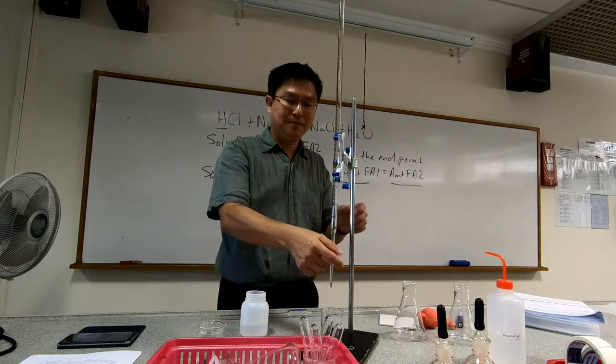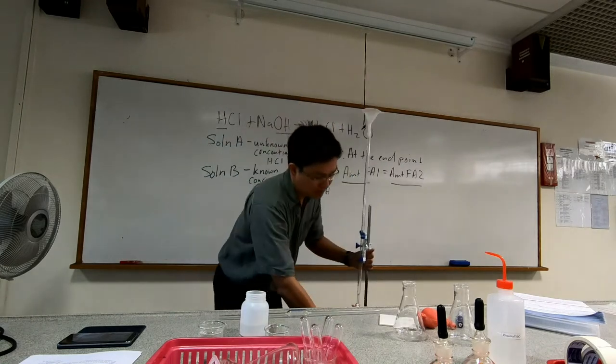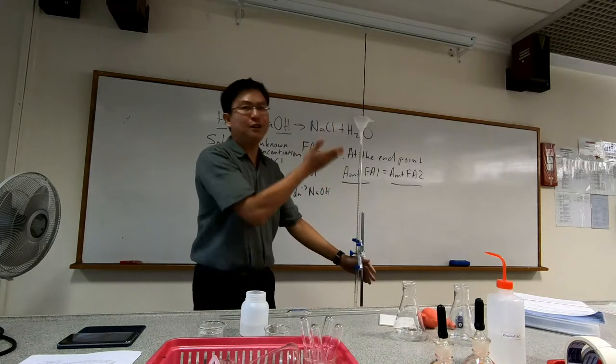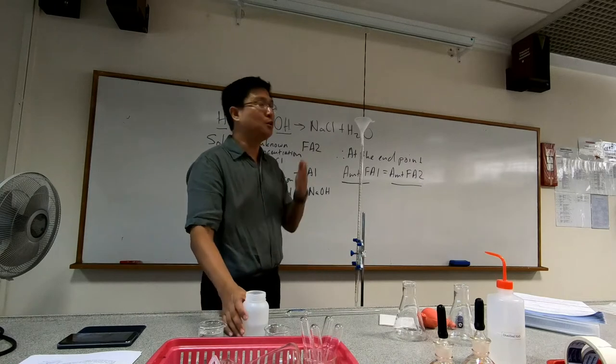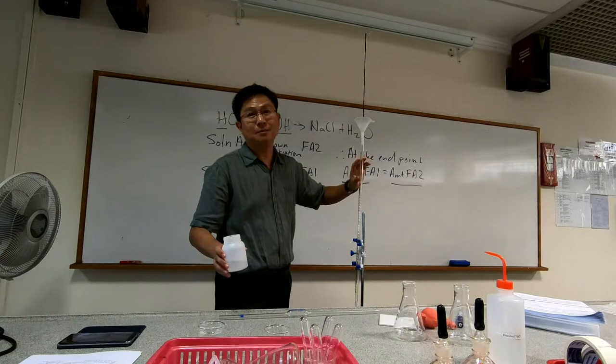When this is done, I then fill up the burette again. So where do I fill up the burette? It is always a good practice to fill up the burette between the 0 and 10th mark.